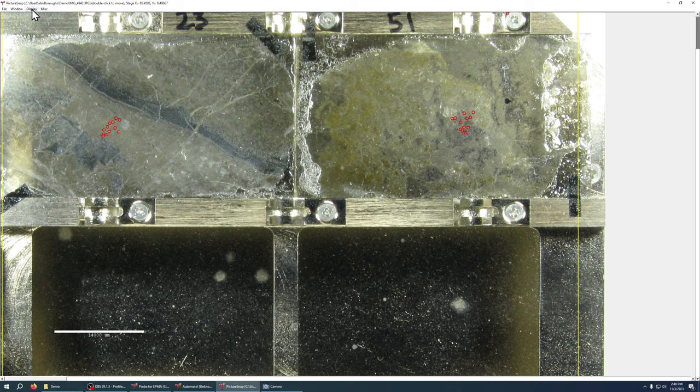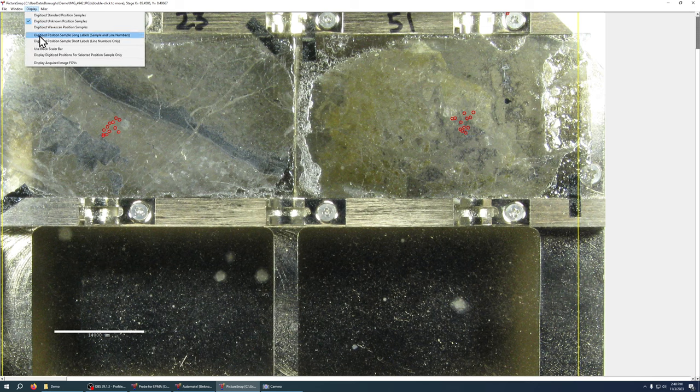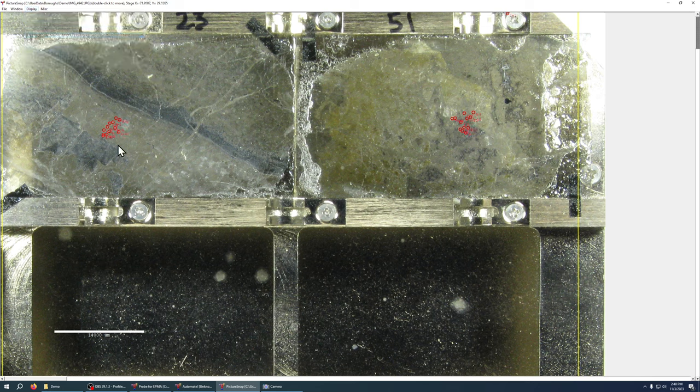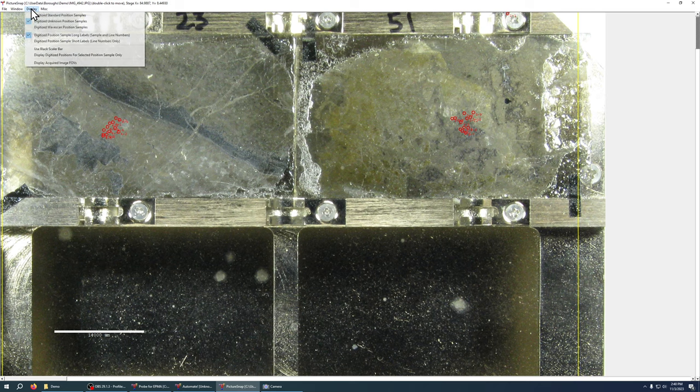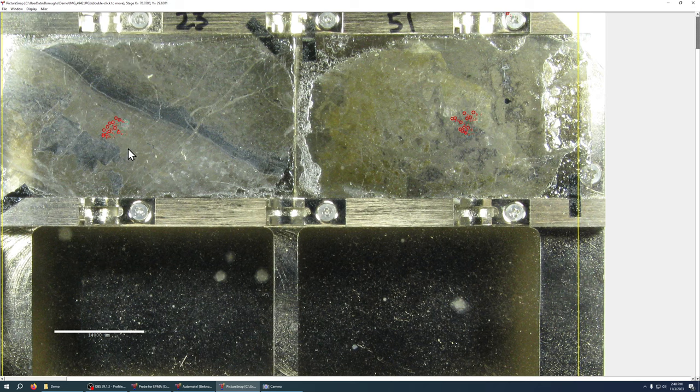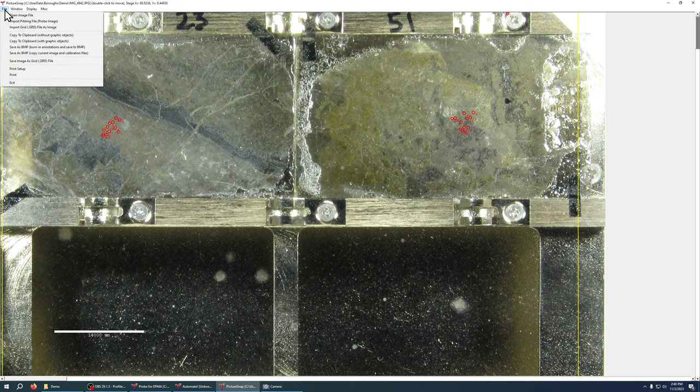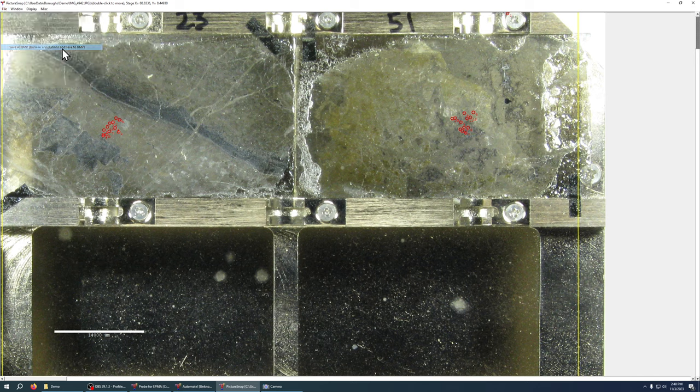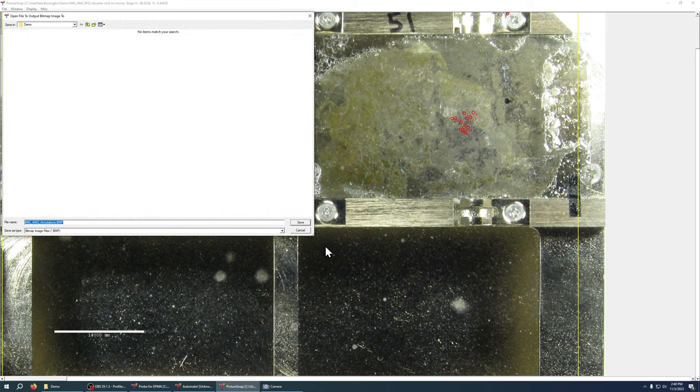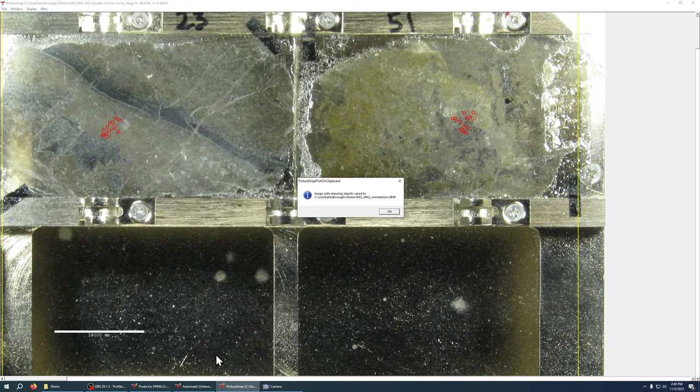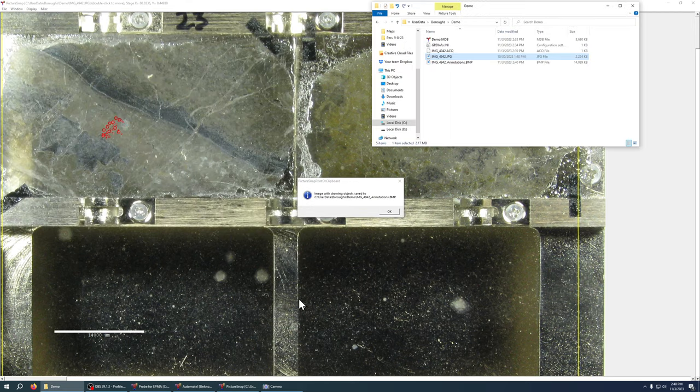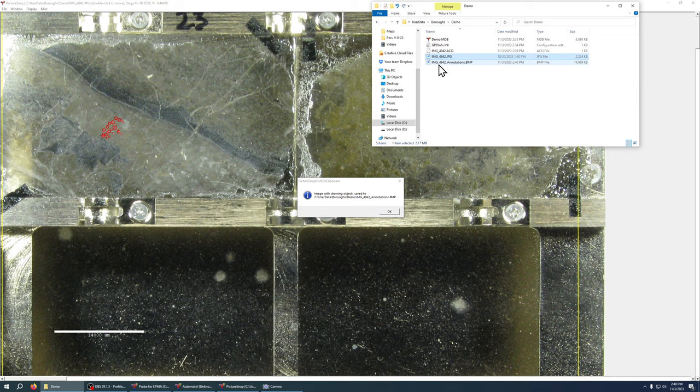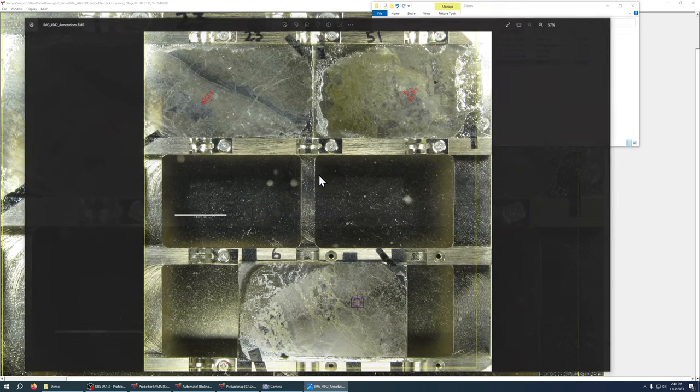You can also go up here and show the labels, long labels that shows the sample number and the line number and you can do short labels which just shows the line number only. And then once you've displayed your analysis points on here you can actually save them, go to save as bmp, burn in these annotations and save to a bmp. And you can now save this file for later reference and we can go and now you can see it shows you where you analyzed all your points.